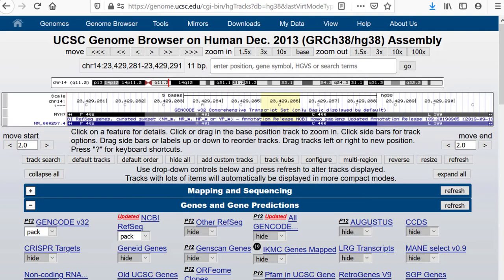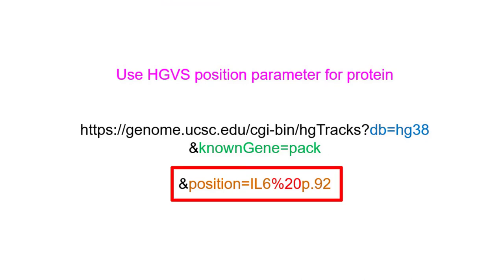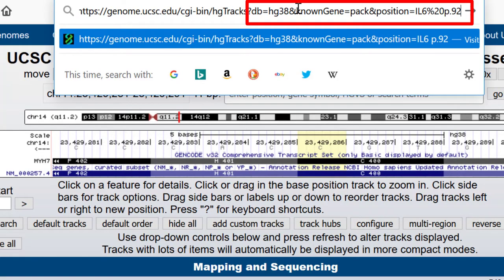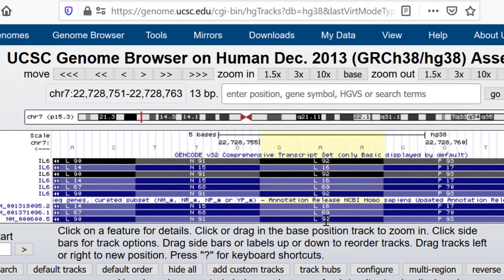Let's try another variation of modified HGVS, in which we just use the gene name and designate an amino acid by its number. We'll go for amino acid 92 of the interleukin-6 gene IL-6, using ampersand position equals IL-6 %20 p.92, where %20 represents a space. The p. is actually optional but recommended. Notice that we are at leucine 92 in one of the isoforms. We did not designate any change for strand in the URL, so it simply added our choice to the parameters already on display.